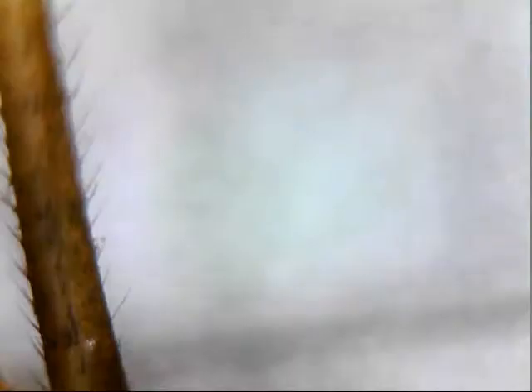Anyway, I'm not a fan. This has gone full rigor mortis as well. I don't know if it's actually called rigor mortis when it's bugs, but it's completely solid.